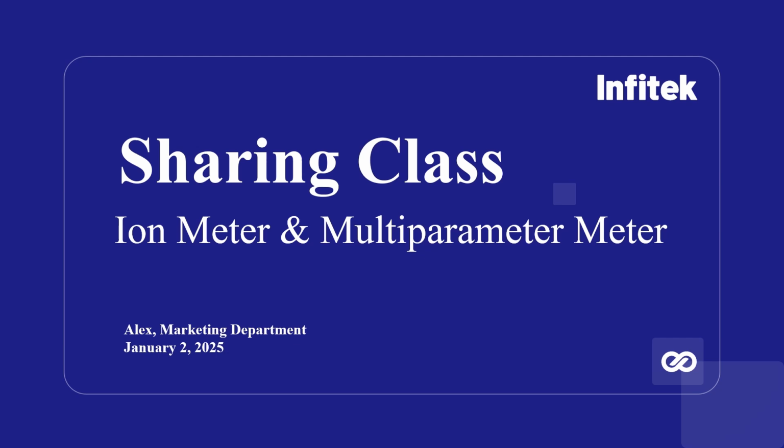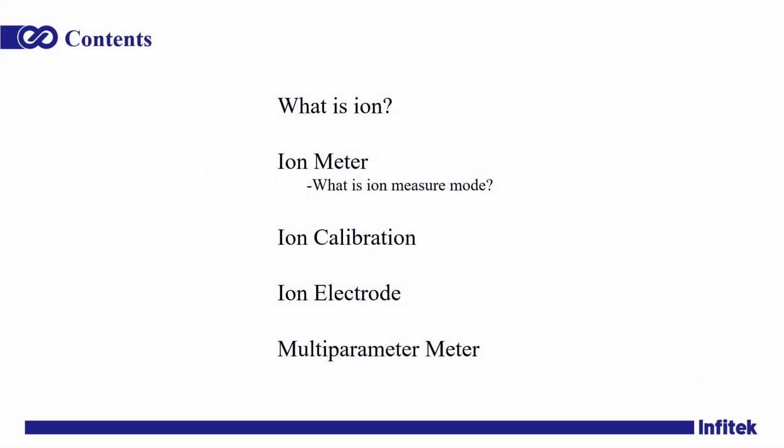Today we are learning about ion meter and multiparameter meter. These are the contents we want to share, including 5 parts.